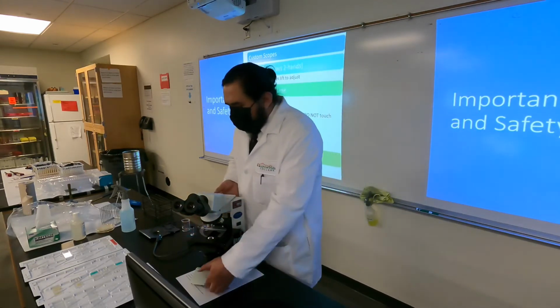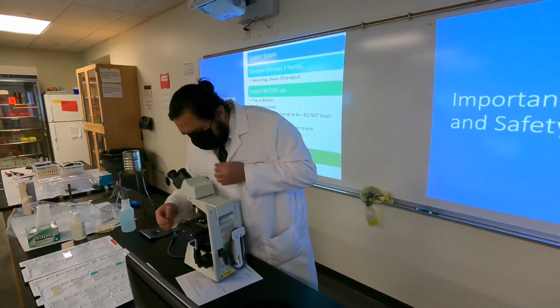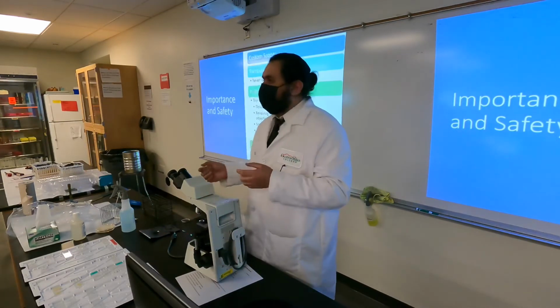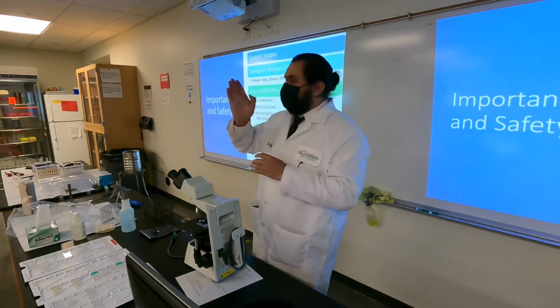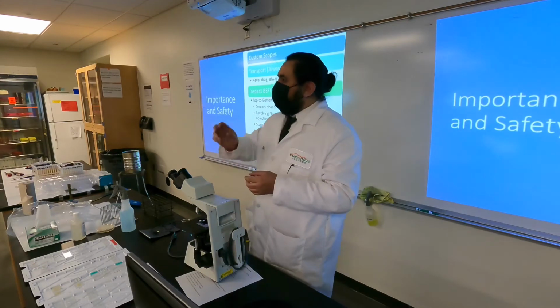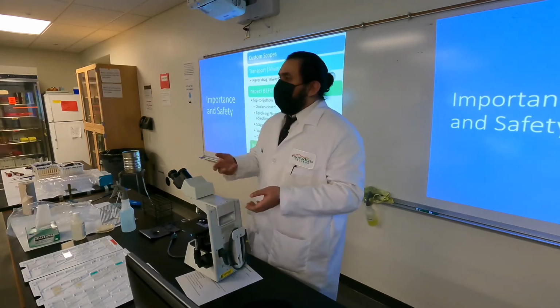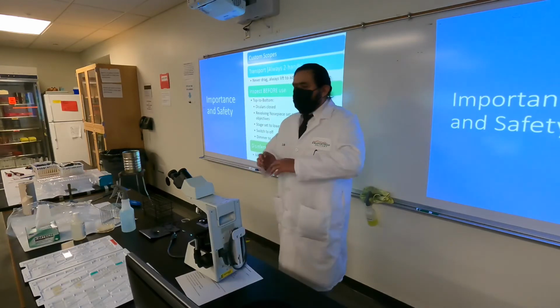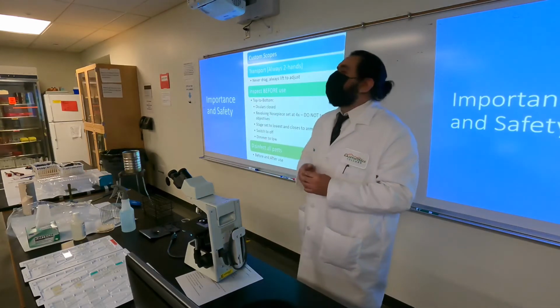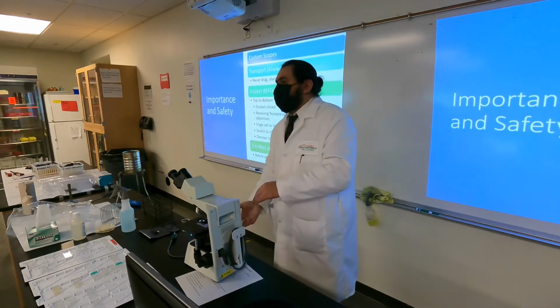And then on the right side of the scope, you'll see on the top the switch that should be set to off. There's a little circle and a little line. The circle means off in this case, and the little line means on. And then you'll have the little knob on the right side, which is the dimmer. The dimmer should be set down to the 1, or the lowest point it can be, by turning it counterclockwise in this case. So double check that all of those things are that way.